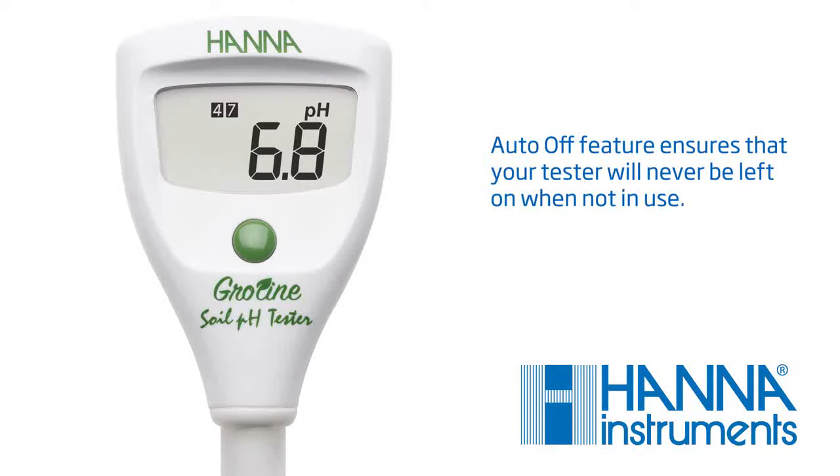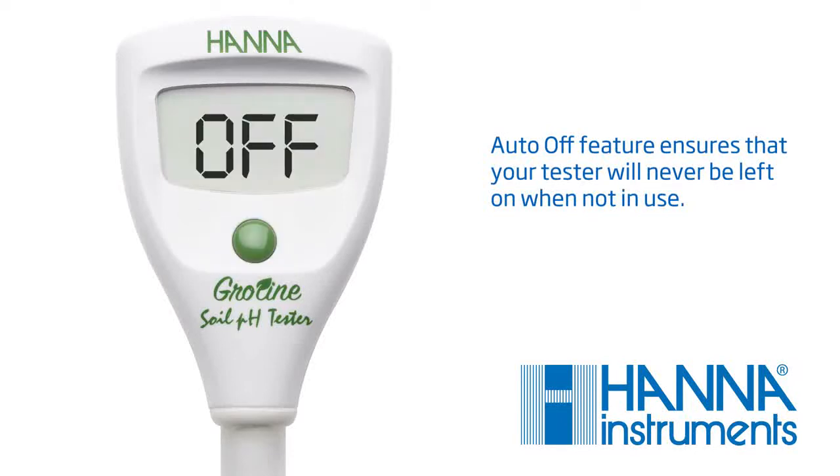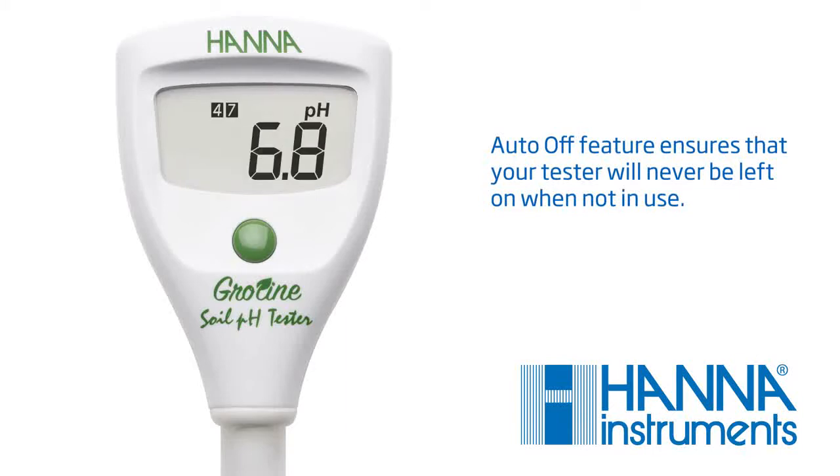To select your preferred setting, press and hold the button for 6 seconds. Here, you can choose a shutoff time of 8 minutes, 60 minutes, or disable the feature. When finished, hold the button for 3 seconds to return to measurement mode.